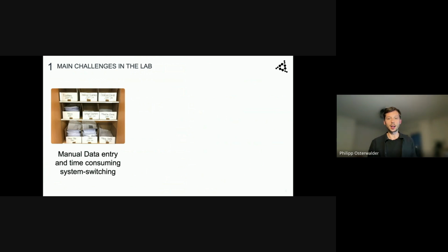So there are a lot of different forms and stages of the digitalization journey, based on your comments, feedback and experience of what we see out there in the laboratory quality control and quality assurance world.